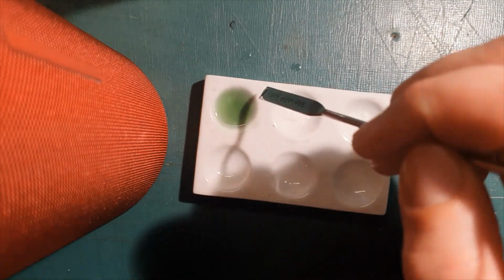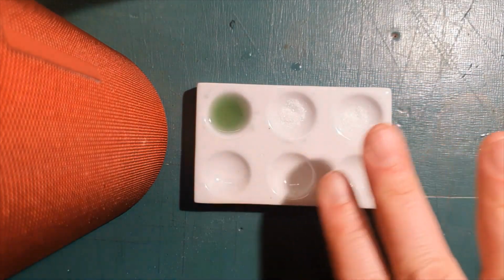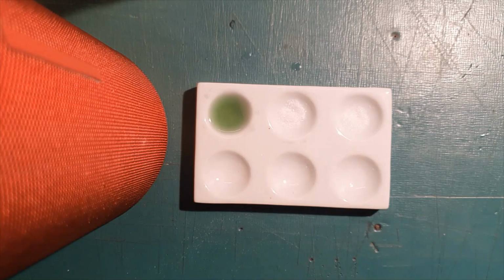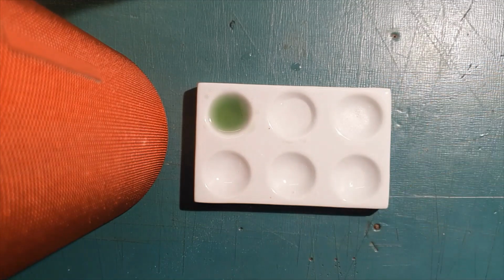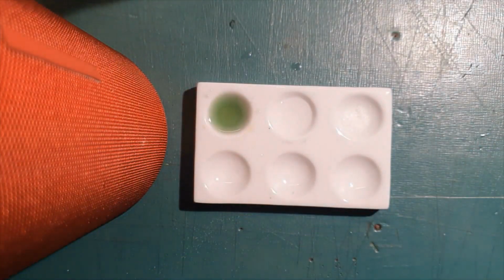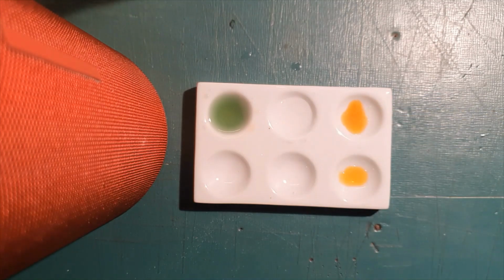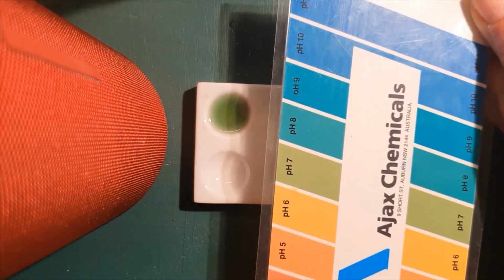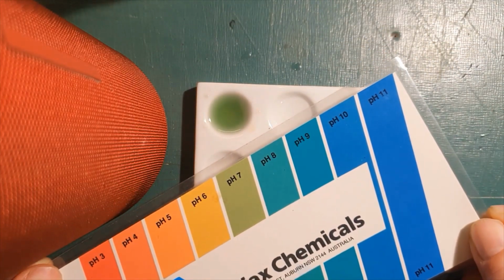All right. Might just let that dissolve for a bit. This one, let's test with vinegar. Reaction to vinegar. Nothing. Okay, and iodine. So remember, iodine is yellow. Let's put some on the sugar. Not much change. And the pH. Where do you think the pH stands? pH of sugar.